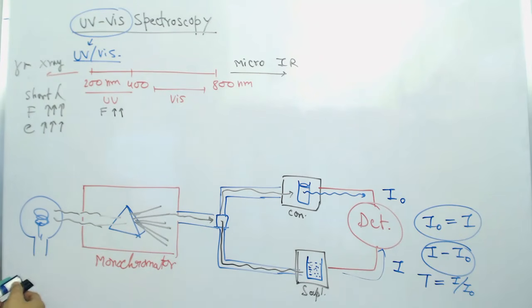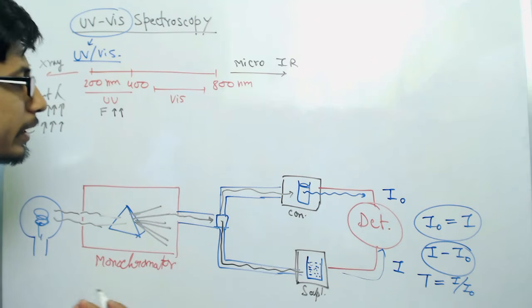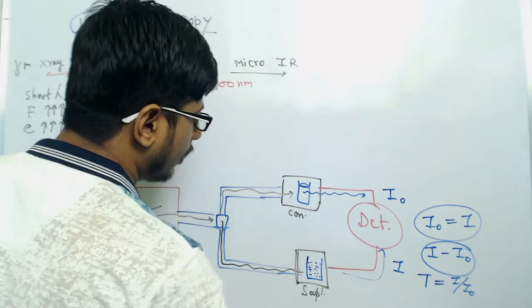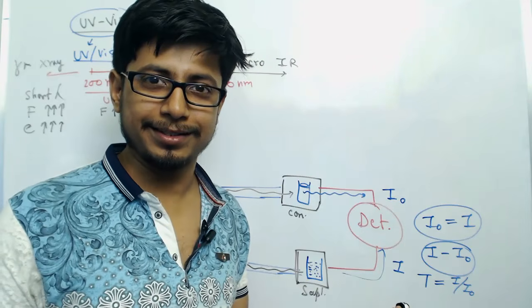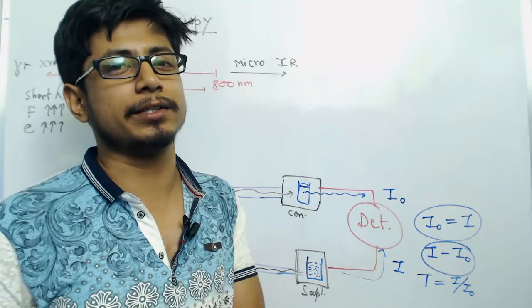So for that, what we can find in this particular case is simply we can plot data with the absorbance and the concentration. So if you know the absorbance, we can also find the concentration from there.